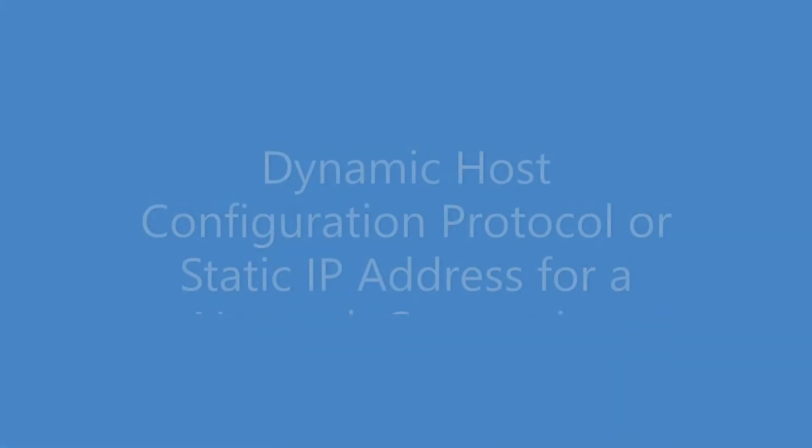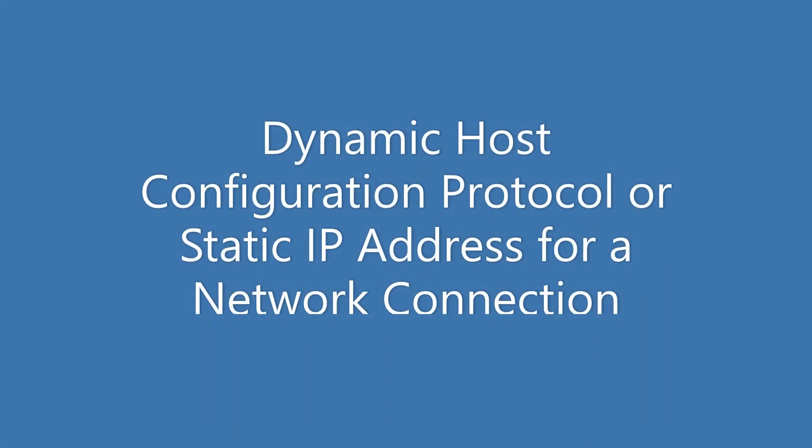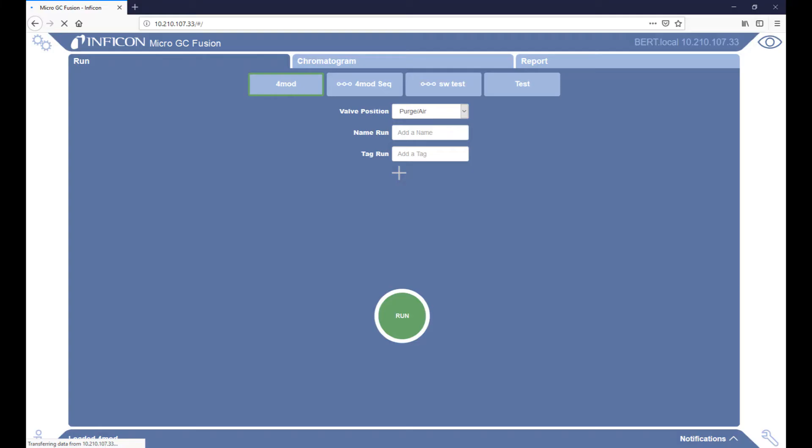Dynamic host configuration protocol or static IP address for a network connection. By default, MicroGC Fusion uses a dynamic host configuration protocol, also known as DHCP.